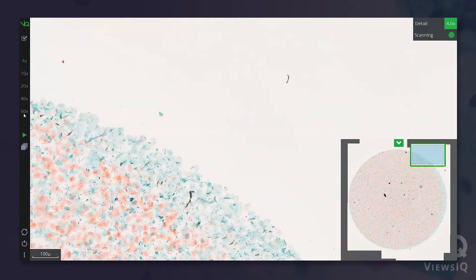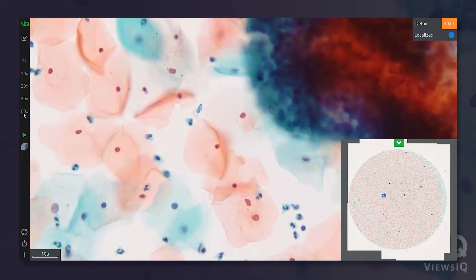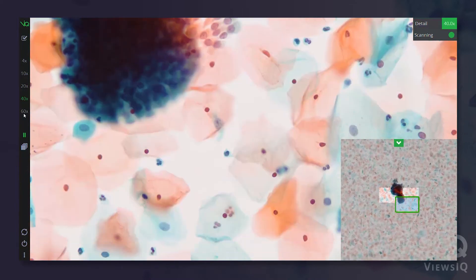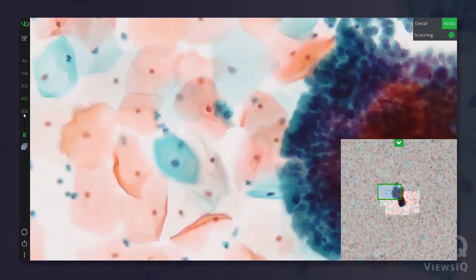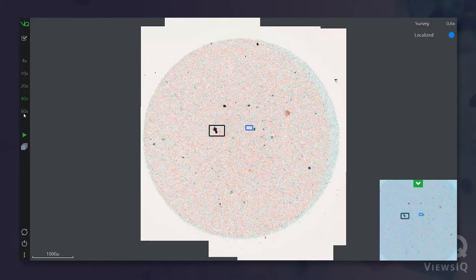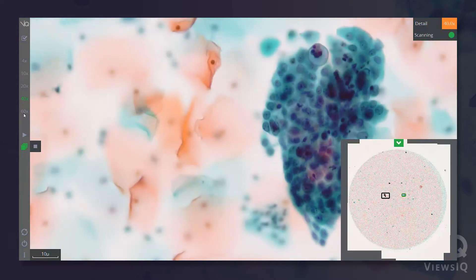Once you've finished surveying the slide, you can now visually see the whole sample at once. Recording higher magnification regions is easy too. Change the objective on the microscope, select the objective in Panoptic and start recording again. Panoptic will record what you view, now at the higher magnification. Recording a 3D volume is quick and simple as well.